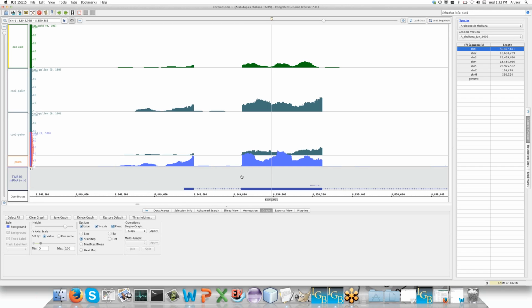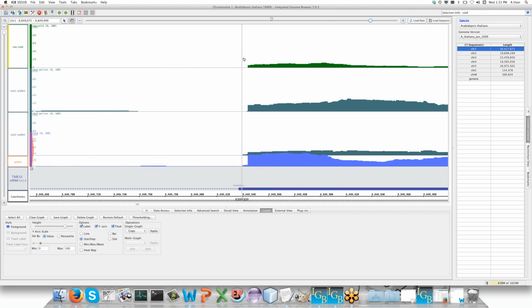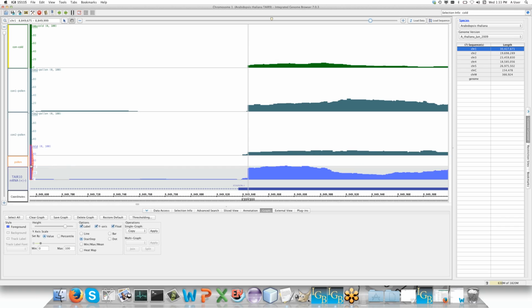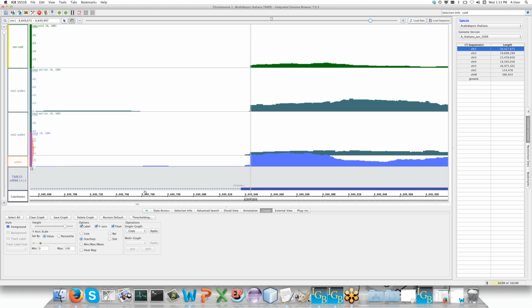So for instance, if you look right in this region, you'll see, once again, and it helps to be floating, that the reads line up in this position, which is distinctly different than the actual annotated splice location. And again, we can sort of lower the graph on top of this to identify just how different it is from what is annotated and what's actually seen in the data.